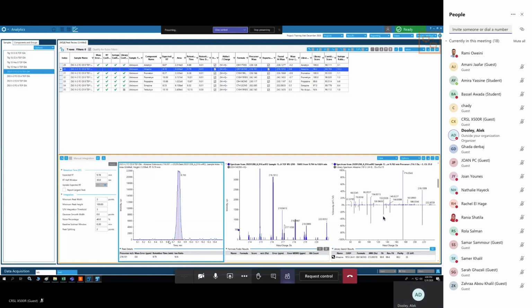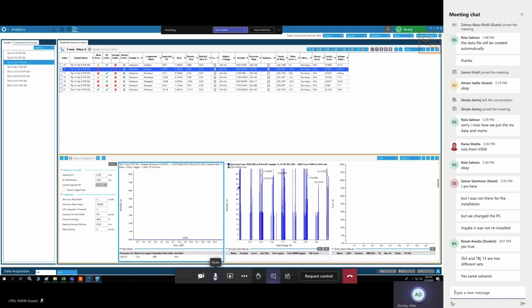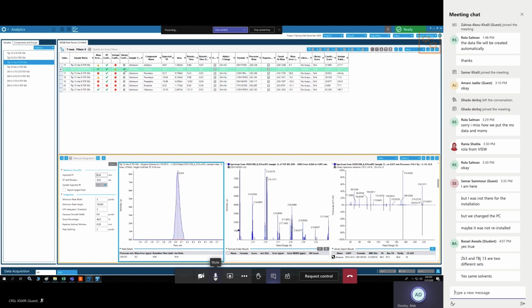That is a drastic difference because here we are 9 minutes, 9.7, and here we are, and it's correct, I'm sure it'll go green. See that? It goes green. So we have a 5-minute difference. Ooh. Same solvents.